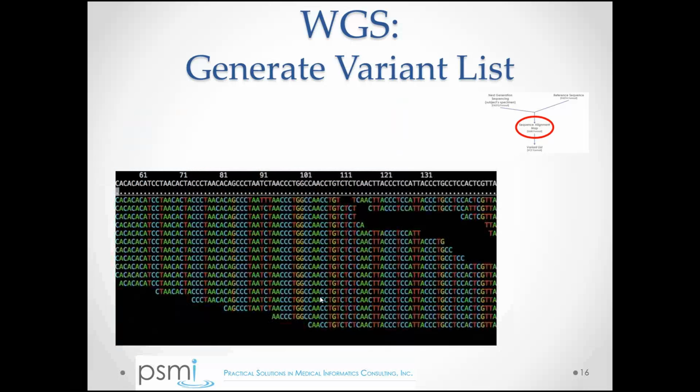And in fact, going back to this slide here, if you notice right here, we have one of the reads called the base at this position a T, but all of the other reads called this a C. And so even if the accuracy of the reads was only 1 in 100, because there are so many reads here, we're pretty confident that in the patient's DNA sequence at this particular locus, this patient has a C, and that the T was some type of artifact.